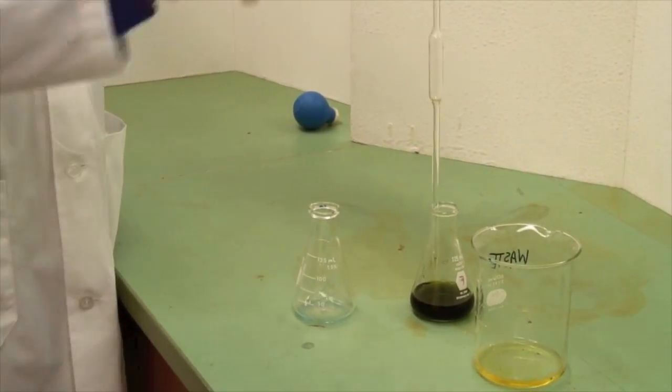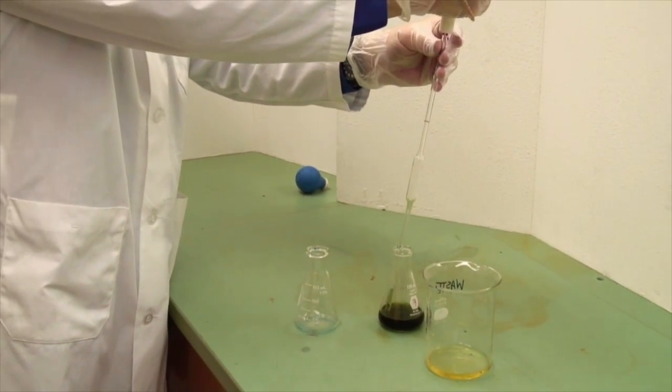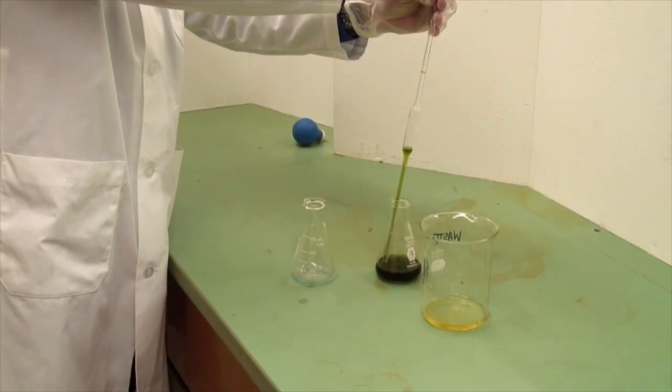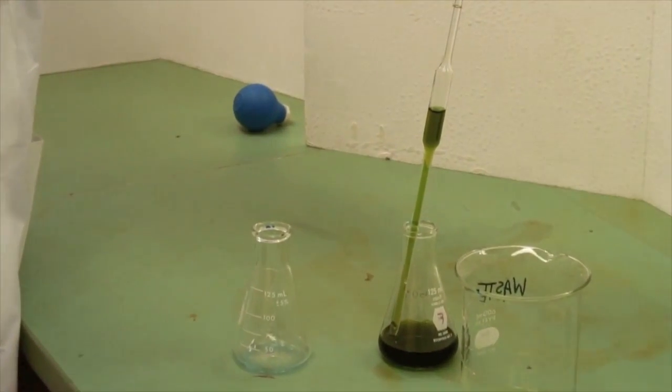We're now ready to dispense 10 milliliters into this flask. Flatten the pipette again and this time apply suction until the liquid in the pipette is above the calibration mark.